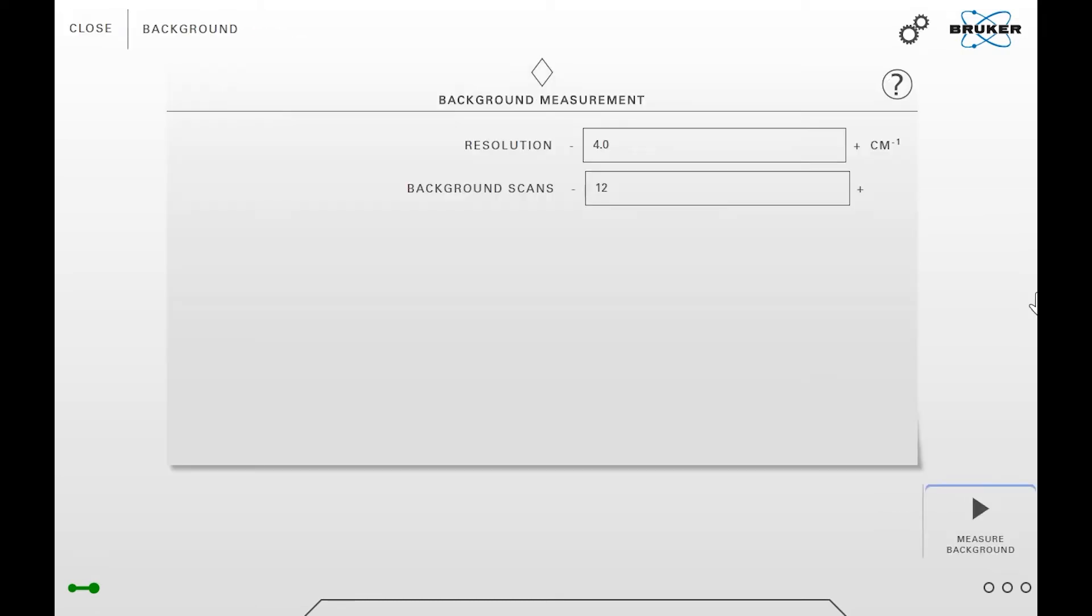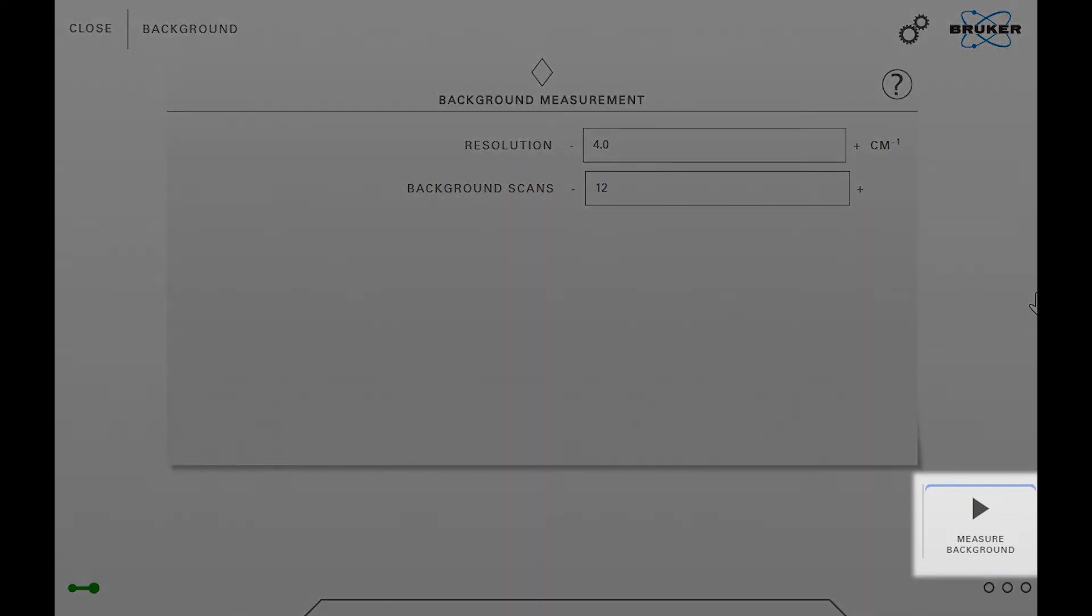The first step is to measure the background spectrum with a clean ATR crystal. Tap measure background in order to start the measurement.